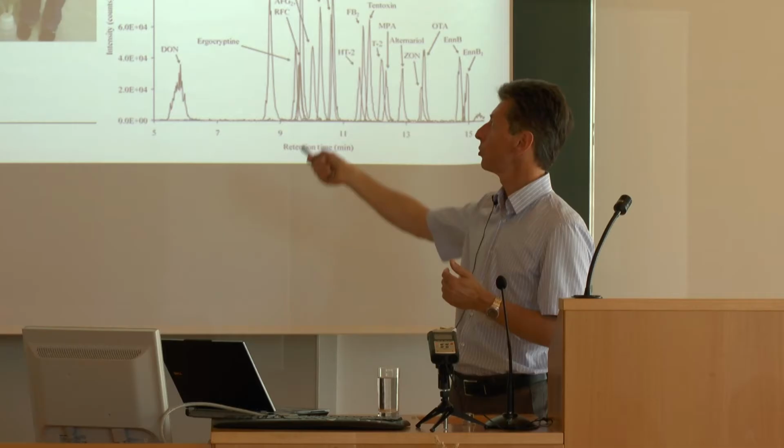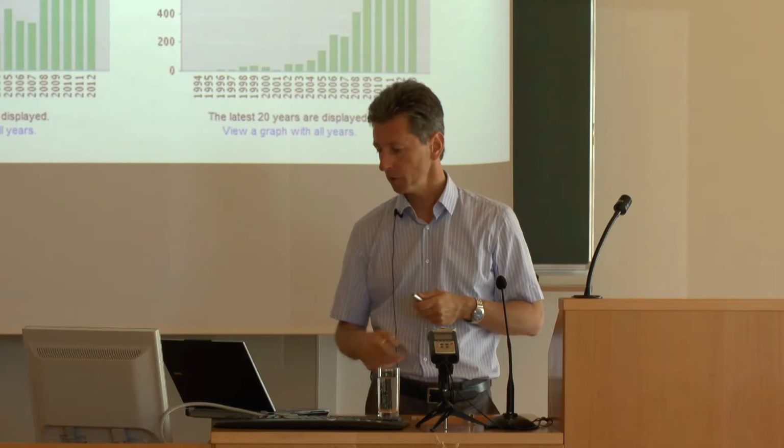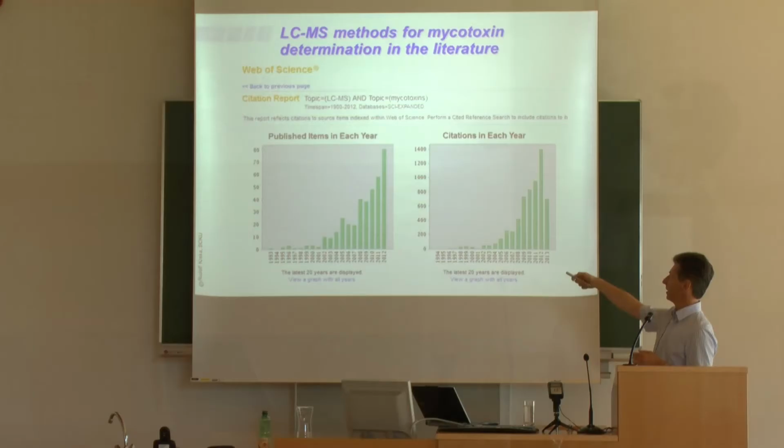However, we are talking here about an instrument which is 700,000 euro. So this is not the instrument you would buy in the first instance in order to detect a couple of mycotoxins. That is also reflected in the Web of Science.